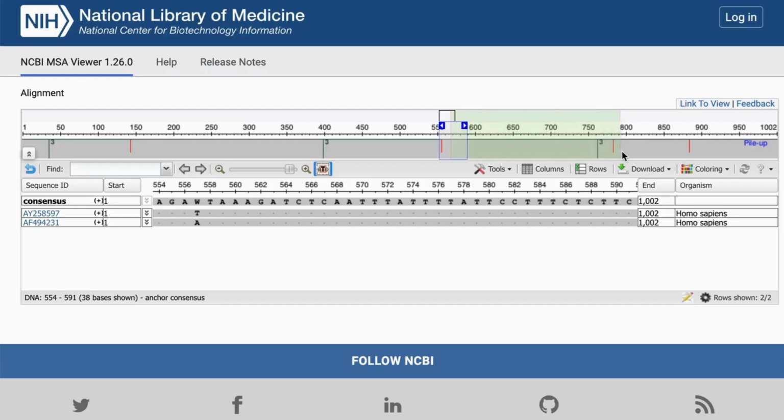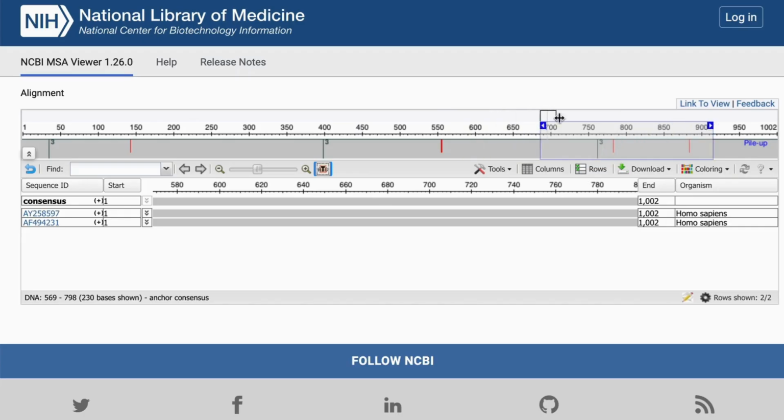You have identified SNVs of the taster and non-taster alleles. Now you will explore whether any of the nucleotide changes lead to changes to the amino acid sequence of either allele. To do so, you will create another alignment in BLAST. This time you will align the amino acid translation of each allele.